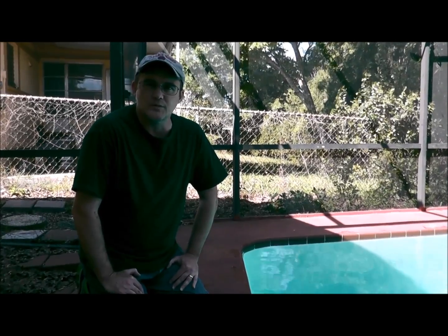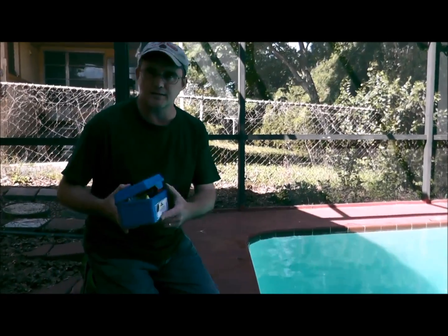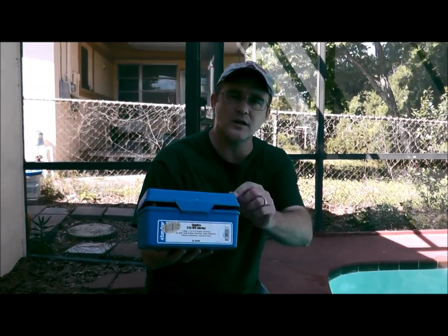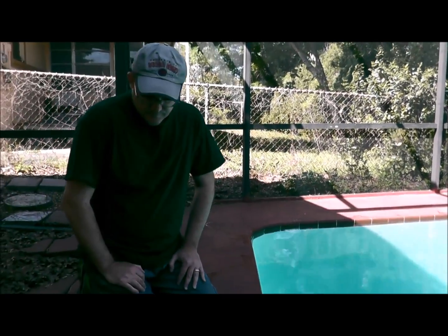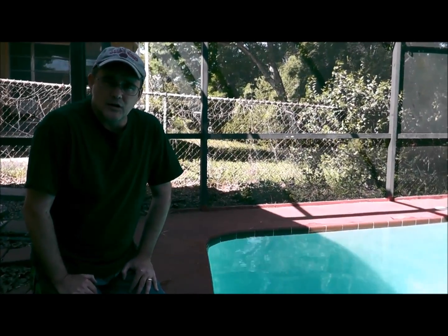Hey, this is Robert with Clean Pool and Spa. In this video I'm going to teach you how to take your chlorine using this test kit right here — it's a K2006 pool water test kit. If you don't have this one, you need to get it because this is going to give you the actual numbers and it's the most accurate.